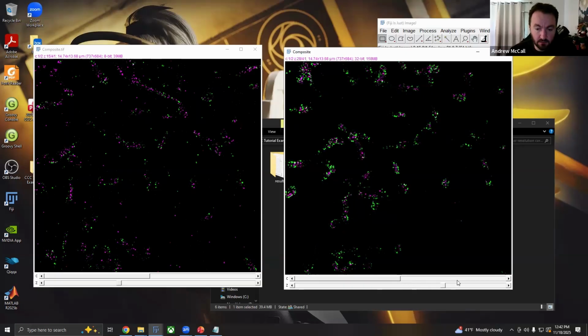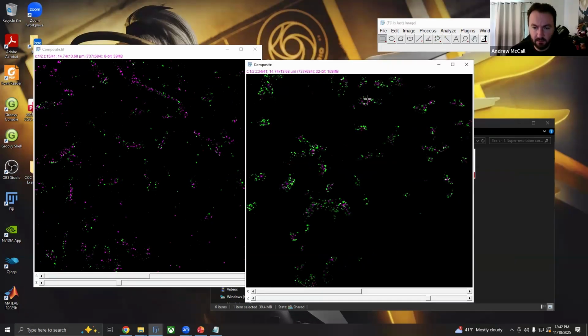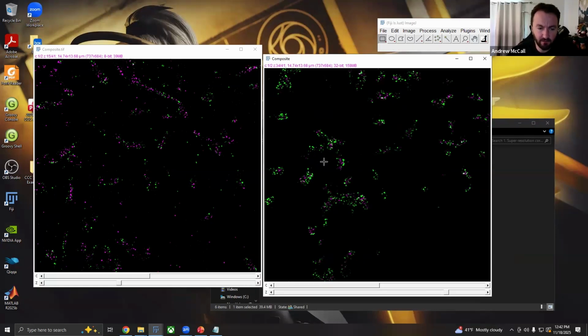And you can do some analysis on this. The one thing you will find is that the intensity values here are absolutely massive, right? And they correlate in no way to the intensity values in the original image. And that is by design. That's because I cannot figure out a normalization scheme to get it so that any of the values here reflect how much of this data actually contributed to that result.